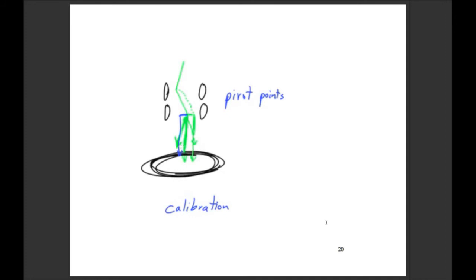No? Okay. Is there a response when it detects that it's hitting a certain point, or is it just a keep image? So most of these alignments are done electronically through the system. You set your sample to eucentric height and eucentric focus, and then you go through a series of alignments, and you'll see a shift in your beam, and you just want to minimize that shift, until the point where they converge. And that's the point where the gun deflector is able to shift and tilt your beam independent of one another.